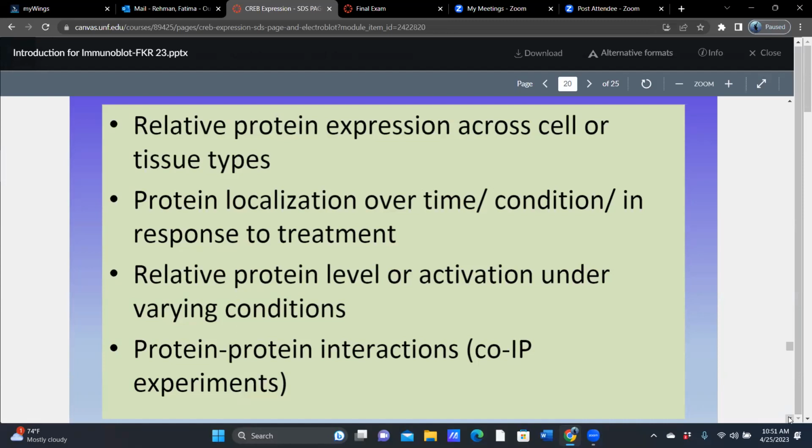We take our protein lysate and we run it through a column with the matrix having our favorite protein on it, or the antibody against our favorite protein. It's going to capture our favorite protein, isolate it like affinity chromatography, and we will also capture anything that was bound to it. So if our favorite protein is, let's say, galectin, and it binds to integrin 1 and it binds to P53 and something else, it's also going to pull those proteins out.